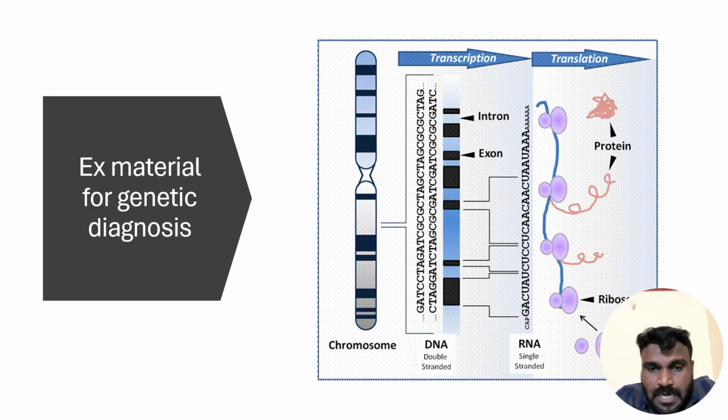And coming to the RNA, the amount of RNA expressed decides the outcome of a phenotype. So we should be able to measure the quantity or the expression levels of mRNA by using Northern blotting. And the same applies to the protein level also. We can quantify it, and sometimes we can qualitatively tell if it is present or not by using this blotting.